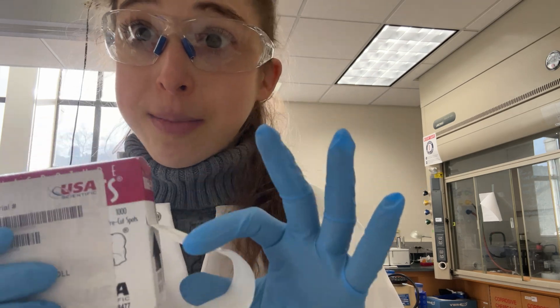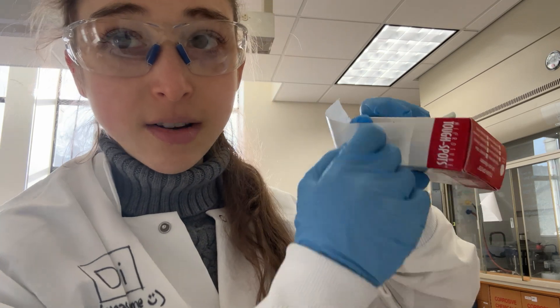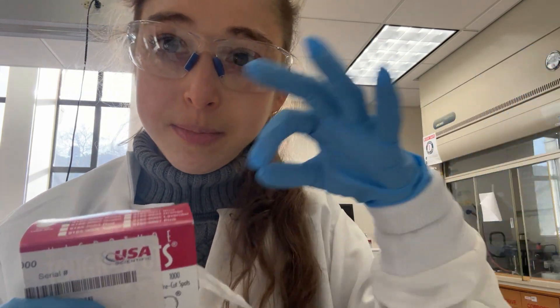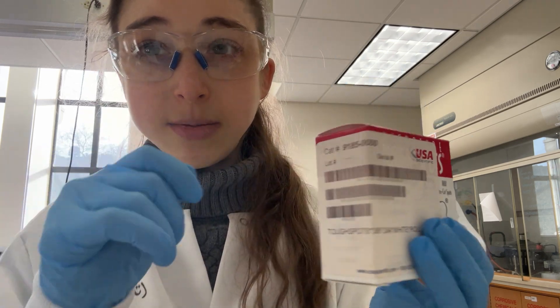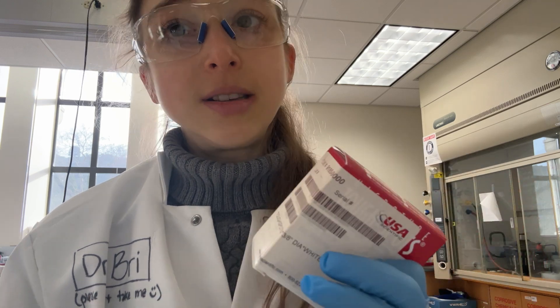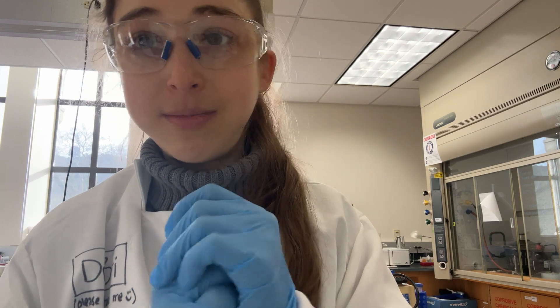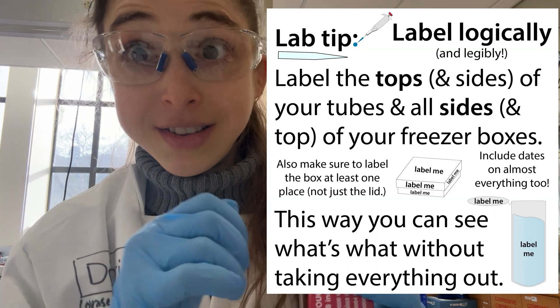Another thing that might pop off is these little cryo dots. They say they're freezer-safe, but don't trust them — they have a tendency to pop off. They can be great when you want to write a bunch of little text, since it's easier on a flat sticker than on the top of tubes, but when the label pops off, that's not good. If you're using tape with these little stickers, I recommend putting some sort of mark underneath them so you know what they are — some code that you write on your box — just in case they pop off and you can't tell the tubes apart. I learned that the hard way with proteins I purified.